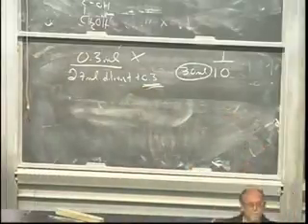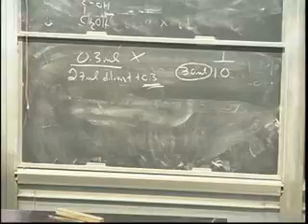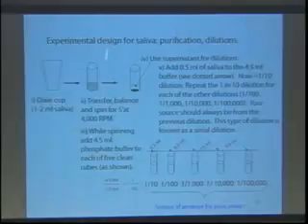So what we're going to do in our case, to make it fast and easy for you, is we have a dispenser that's preset to 4.5 mls. So to get a 1 in 10-fold dilution, it's half a ml. The way you do this is you spit in a cup and get a couple mls of saliva. It's going to be very foamy. It's okay. Centrifuge it. Balance the tubes. Put them opposite one another in the centrifuge.